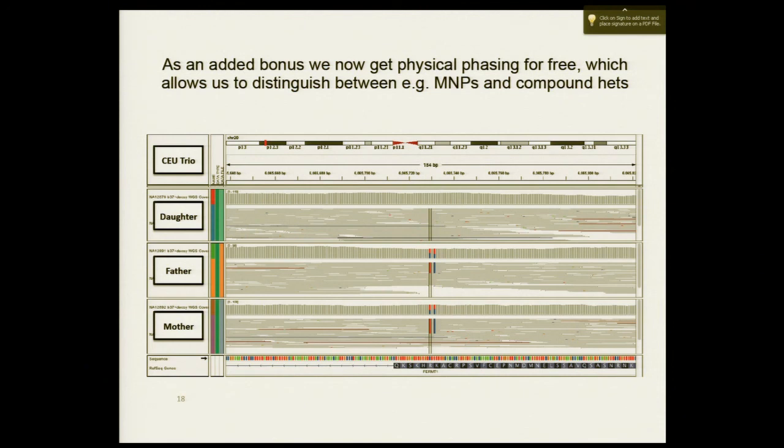So probably everyone appreciates this because it's in the coding region. It's very, very nice. Any questions about that one? What's up? Can you give a more precise definition for multinucleotide polymorphism? Oh, so by multinucleotide, I just mean that it's not a SNP. It's a variant that is 2 changes, right?